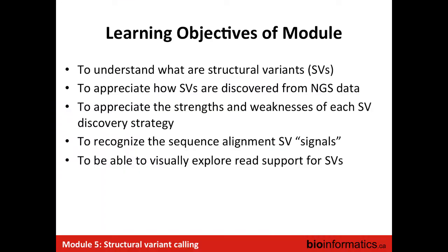So in that lecture, I will try to make you understand what structural variants are first, and how we can discover them using NGS data. And to that end, the different strategies you can have, what are the strengths and weaknesses, and a bit of how we can see these variants in IGV.